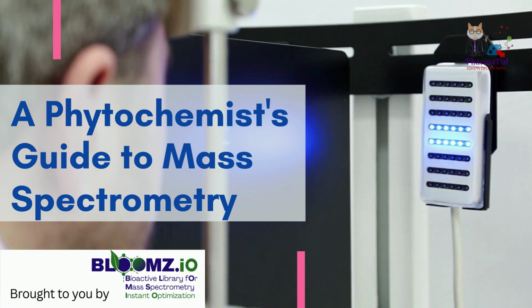It's crucial for identification. Now, I know natural product extracts are messy, super complex. How does mass spec deal with that? I imagine you could have different molecules that weigh the same. Oh, absolutely. That's a major hurdle. Isobaric compounds: same nominal mass, different formula, and isomers: same formula, different arrangement. They can be really hard to distinguish just by weight. So how does a phytochemist tackle that? This must be where the tuning comes in.